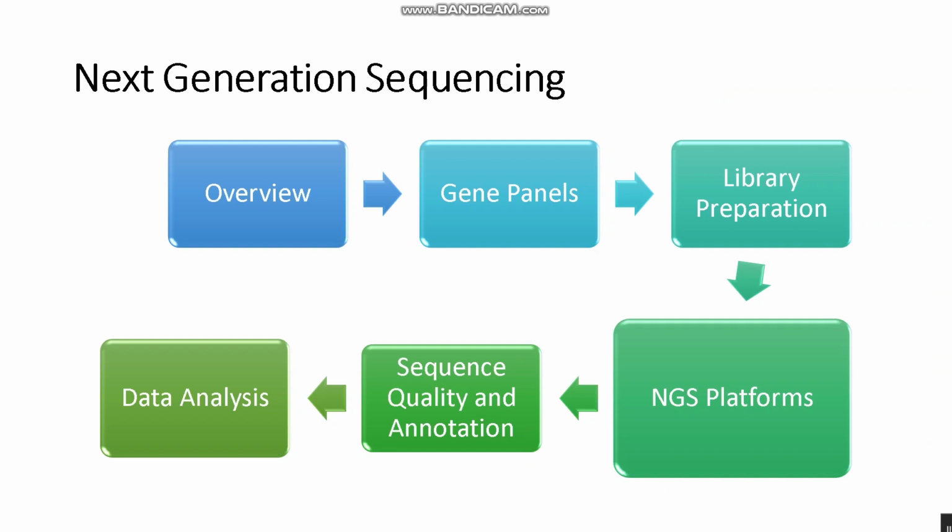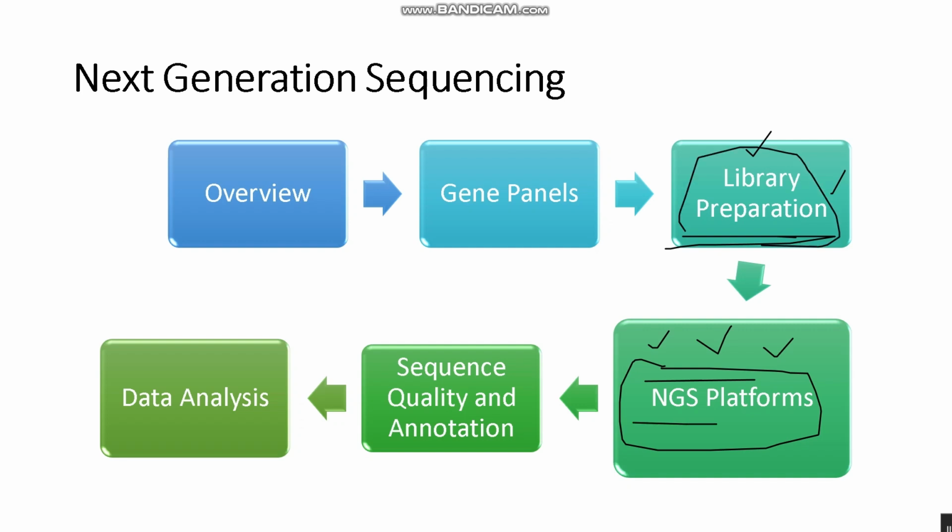Now the next part is NGS platforms. After library preparation, we dive into the NGS platforms. After library preparation, we amplify the DNA fragments. Now we sequence the DNA fragments.